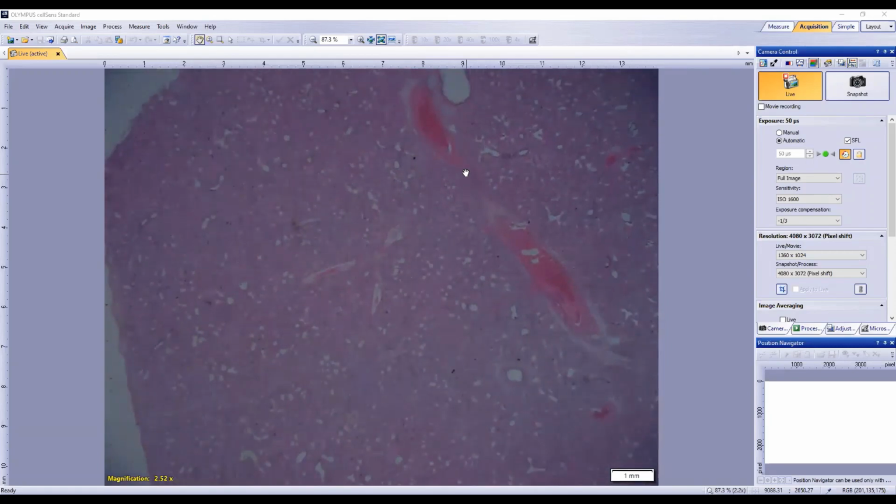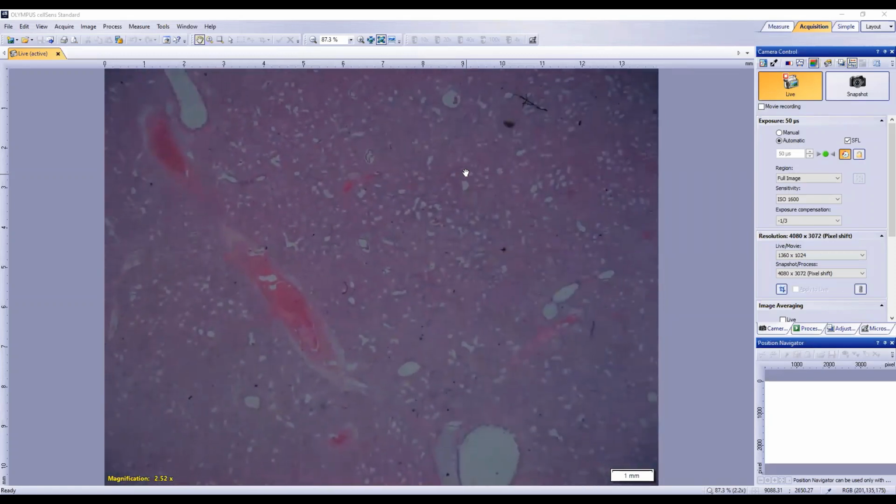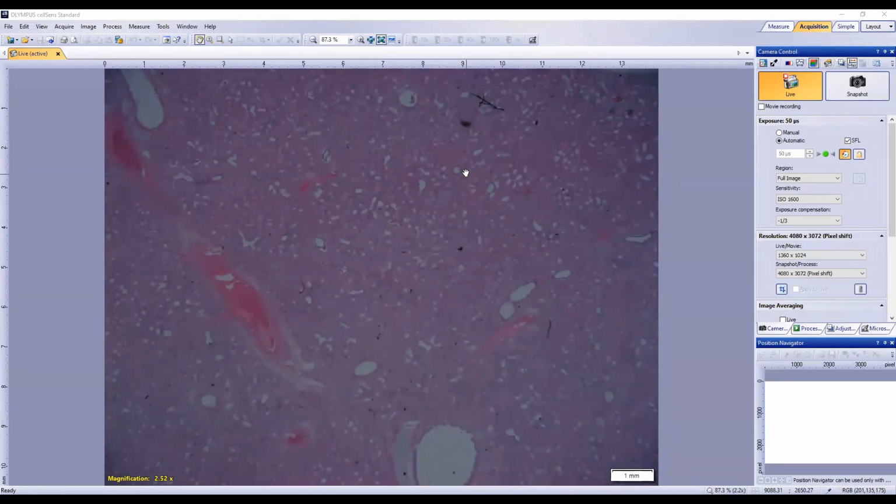So what microanatomy can we visualize at this power, and more clearly than lower when it looked more like a liver? And feel free to use your clock face as well. So like this will be 12 o'clock, 3 o'clock out this way, 6 and 9, and then variants in between. Or compass points of the arrow if you like. So what have we got in this field in terms of our microanatomy?